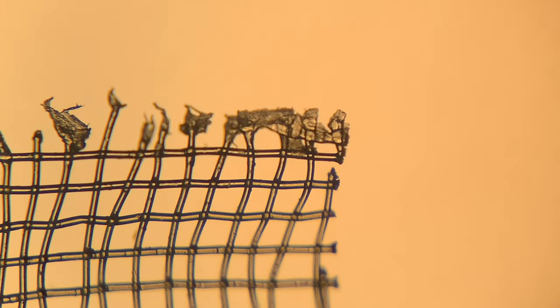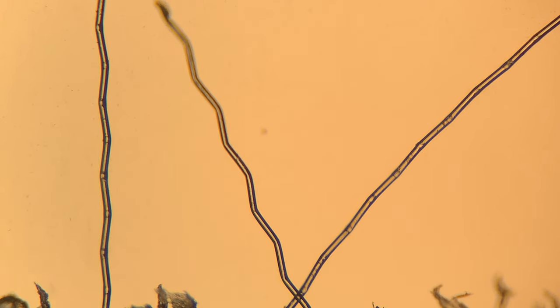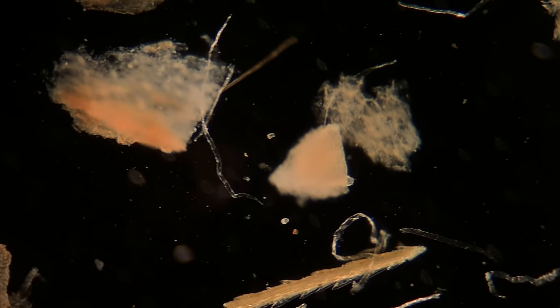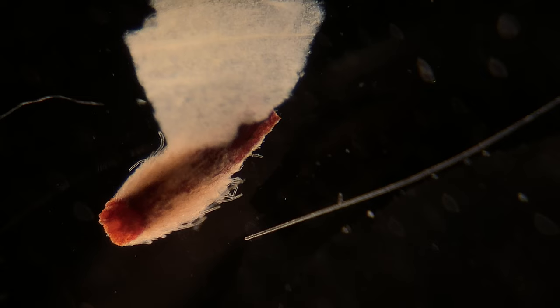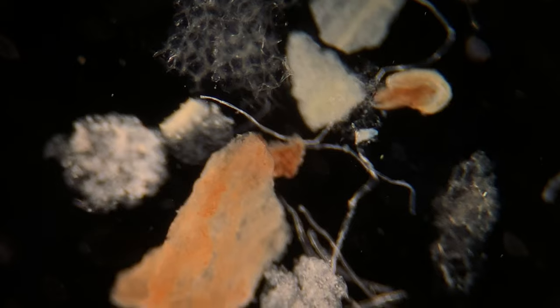Let's go ahead and look at the bags themselves. This is the teabag on its own, and you can see it is composed of very fine woven fibers, which are presumably made out of nylon — very easy to work with, which is why they're used for things like this. We're looking for some small thin strings that supposedly break down under heat. One thing we aren't able to see are the nanoplastics — those really, really small particles that even a compound microscope wouldn't be good enough for. You'd need an electron microscope, because nanoplastics could be down to the size of things like DNA. But I was able to see a decent amount of small little strings here and there that I believe were from the nylon mesh.